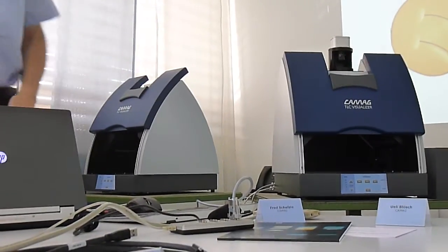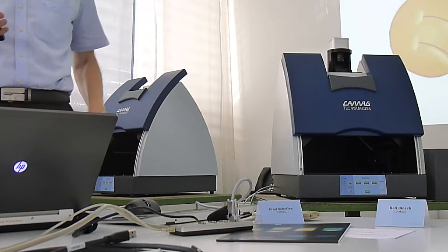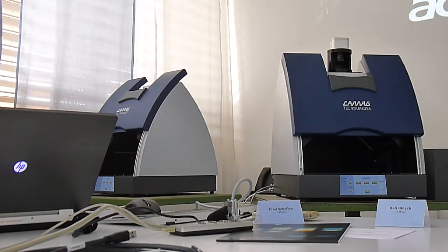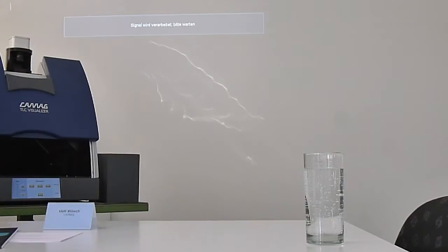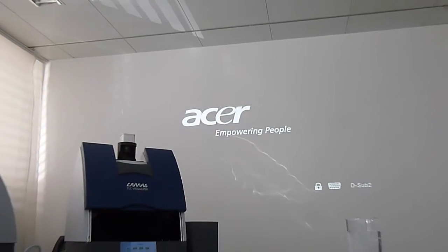So let's see if this is working, because it's always the same thing. As I said, Firewire doesn't like Windows.